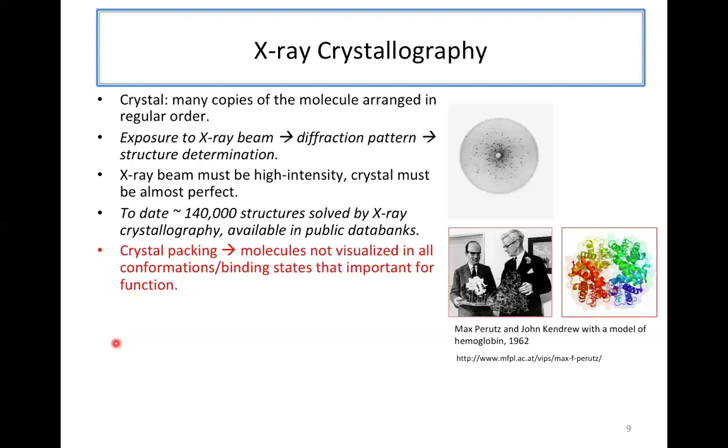Now, there are problems with X-ray crystallography because of the crystal packing. The molecules are not visualized in all conformations and binding states that are important for function. And sometimes the structure has no relevance at all.